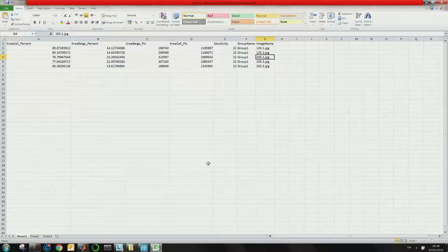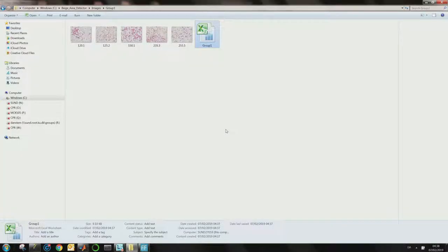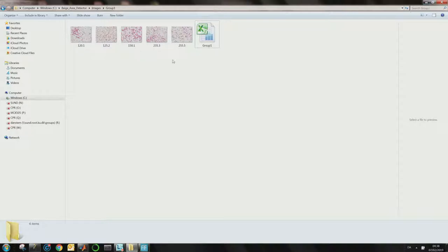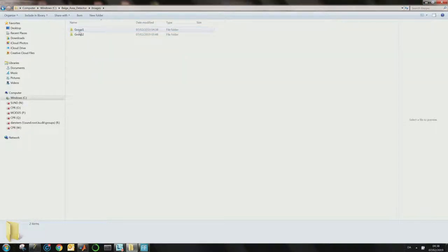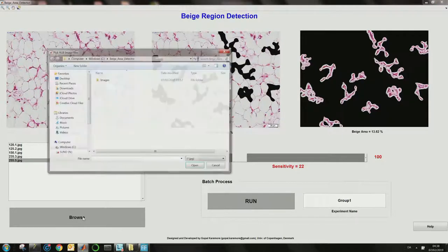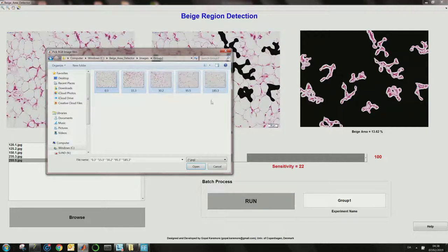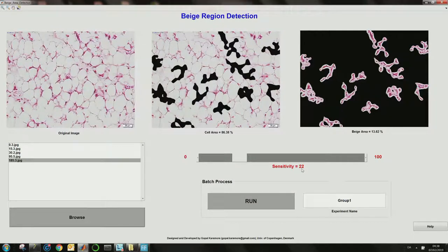Similarly, you can do this for different groups. Let's say I divide into group one and group two, with different images. I go back to the software, upload images from group two, select all of them, apply the same threshold, and in the batch toolbar give group two as the experiment name to process all images using the same settings.